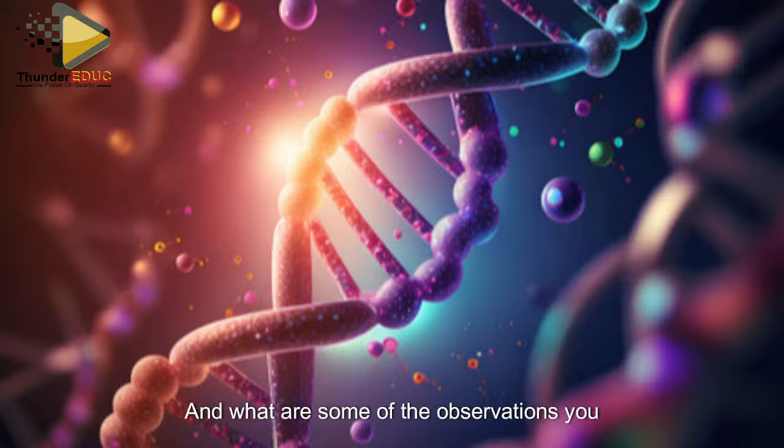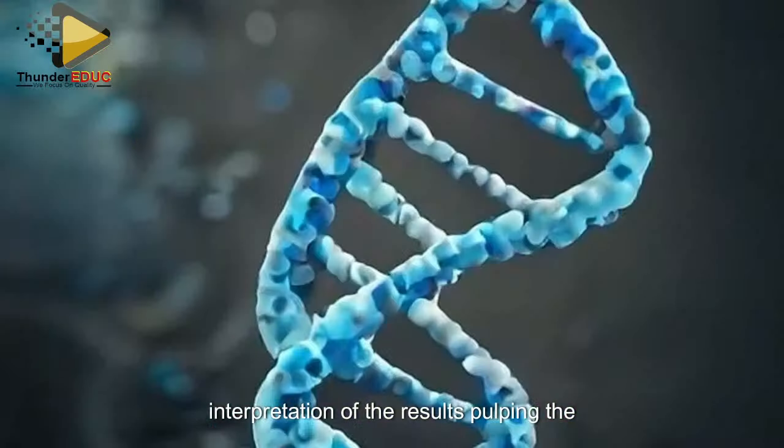What are some of the observations you saw? Yeah, here we are talking about what you see with the naked eye. DNA is visible as a clump of white, sticky, or wet cotton-like mass, something like that. So it depends on what exactly you have seen, but that's what we have seen. Then you can talk about the discussion and the interpretation of the results.